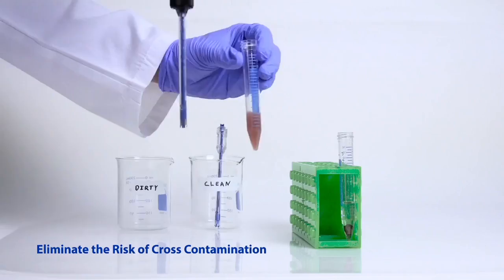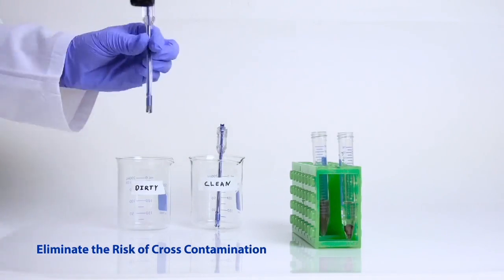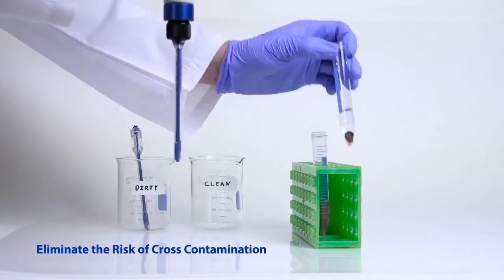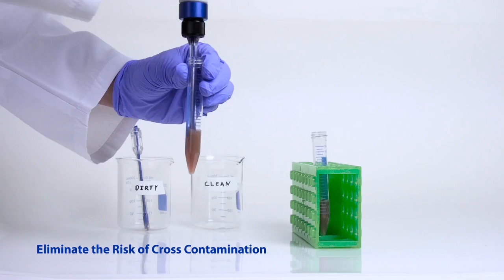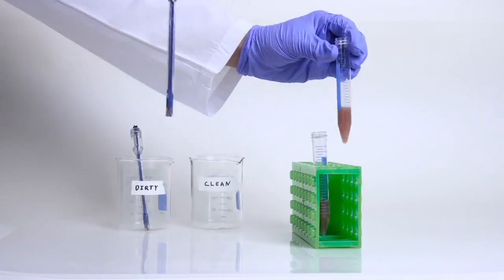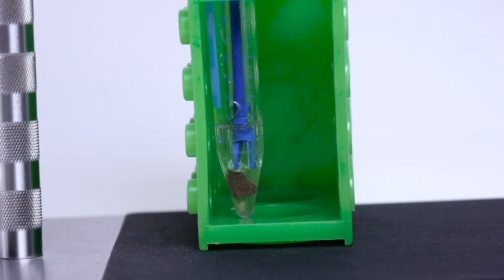When used with the THQ, Omni-tip generator probes virtually eliminate the risk of cross-contamination, carryover, and sample loss. Omni-tips are maintenance-free and economically priced to encourage one-time usage.